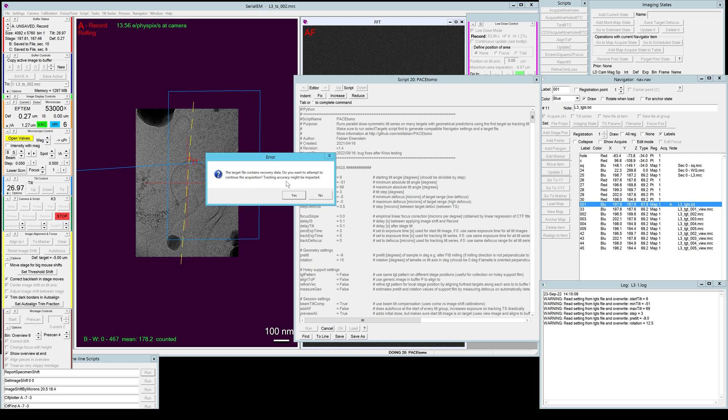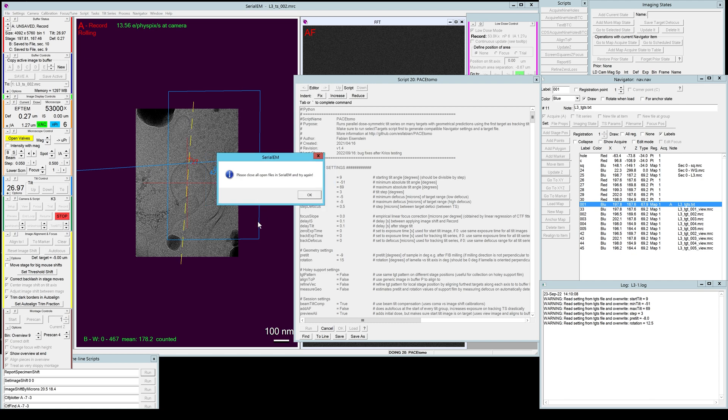So that is true. There might be a small penalty in tracking accuracy. But if you did not move the stage between stopping and continuing, it's usually not bad. And even if you move the stage, the errors are maybe a bit worse for the first couple of tilt images, but then lock in quite nicely again. Either way, it's nice to have the option, let's say if the run crashes for another reason, for example.